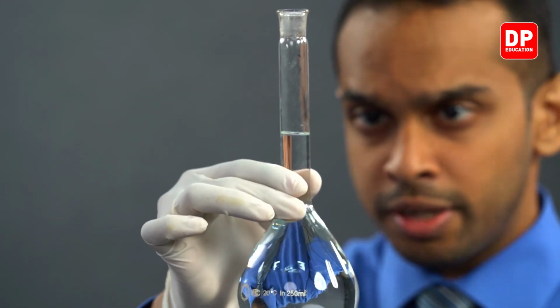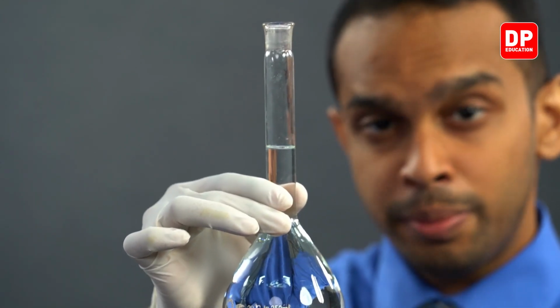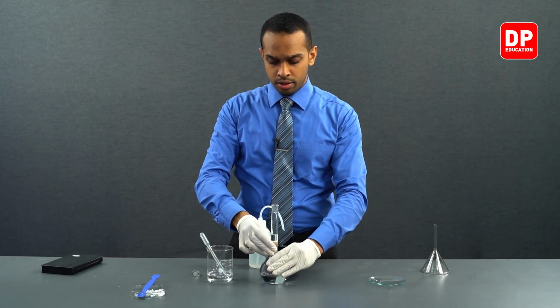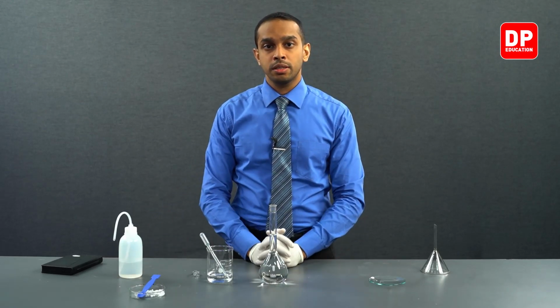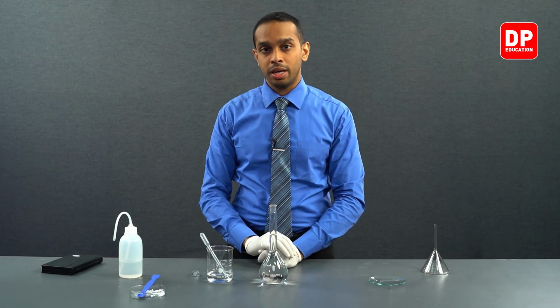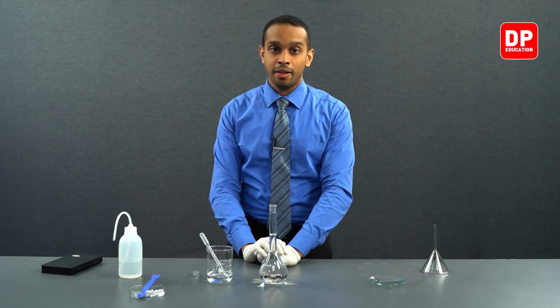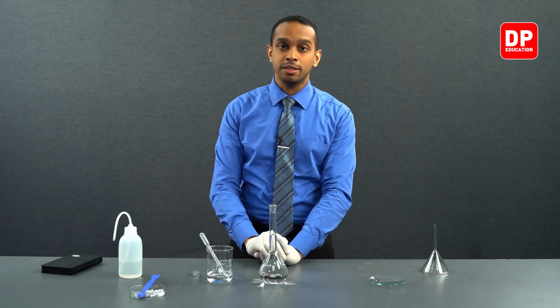Now the volumetric flask gradient line and the bottom level of the meniscus of the solution perfectly align. So if you are unable to hold the volumetric flask straight, what you can do is place it on a table, and bring your eye level down to that gradient line, and then observe if you have actually prepared the standard solution properly.